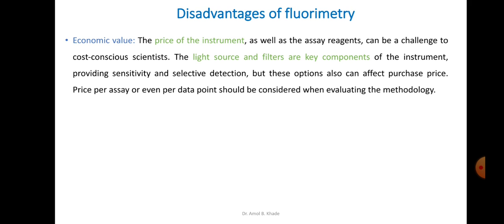So usually the cost of the fluorimeter or the spectrofluorimeter is high as compared to the absorption spectroscopic instruments, but they're sensitive, they're selective. So what kind of samples you want to find out, with what accuracy you want, with what precision you want, with what limit of detection you want to quantify, all those things really matter when you are deciding between UV visible spectroscopy and fluorimetry or fluorescence spectroscopy.